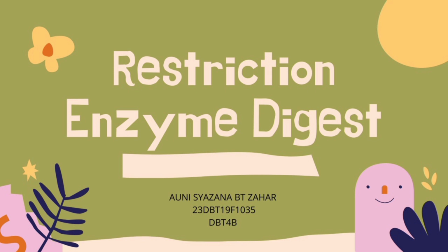23DBT19F1035. Today, I will be running the next lab, which is Restriction Enzyme Digest. What is Restriction Enzyme Digest?